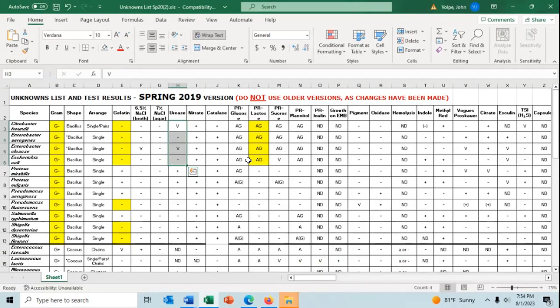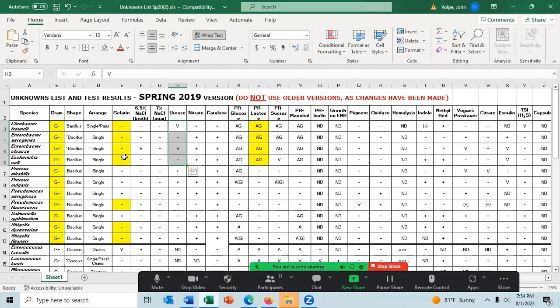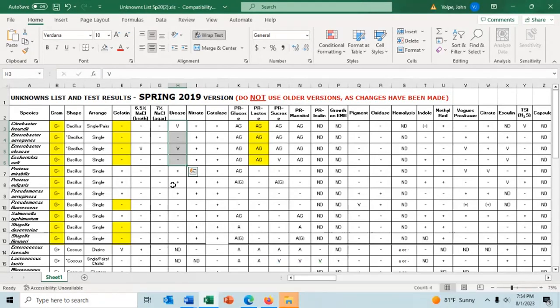In dichotomous logic, you normally run the gelatin hydrolysis test, wait for the results to come, then you run the gram stain test, wait for the results to come in, and then you run the PR lactose test. Well, that's a little complicated, so I'm doing it this way. It's still following dichotomous logic, and that way I only have to send off 1 message instead of 3, and 1's just better than 3. 3 is doable, but I'm not going to do it that way. Any question?